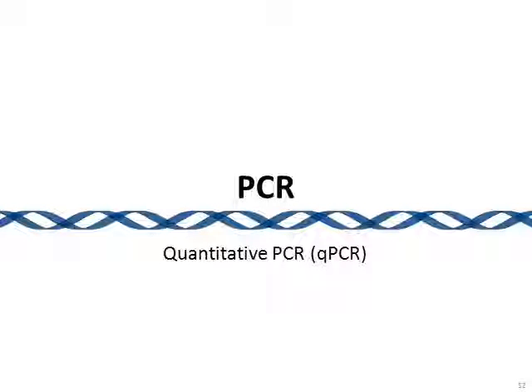Okay, well, now that we've taken a very close look at PCR, including all the various conditions involved, the various problems that can occur, all the thermodynamics, and good primer design, let's take a look at some of the various applications of PCR and the variants of the process, starting with quantitative PCR.